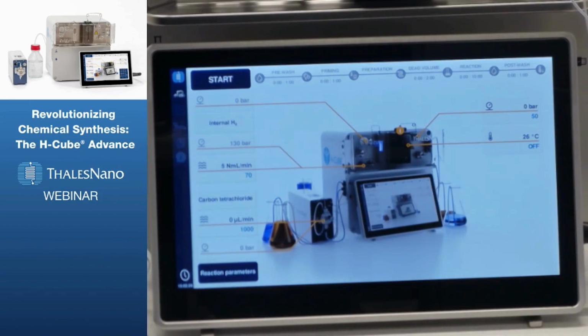So you can set up individual times for how long you would like to wash the system with a clean solvent. So if you set those times, the valves that will switch between the solvent and the reactant, and also the product and waste, will automatically be switched once these set times are over. You can also set up reaction times as well, and the injection of the real starting material will be continued until this time is up. To do a manual operation of this, you just set all of the times to 0.